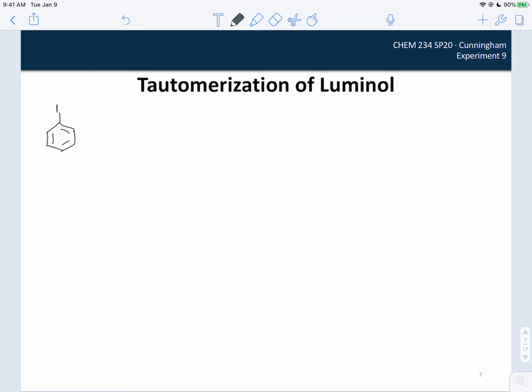So I'm going to go ahead and draw our starting material. Actually, I'm going to draw the product after we've reacted our initial dicarboxylic acid with our hydrazine. So we take this intermediate here, our 5-nitrophthalhydrazide, and we react this with our sodium hydrosulfite, with sodium hydroxide and water.